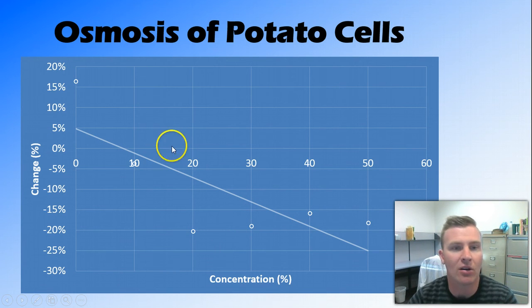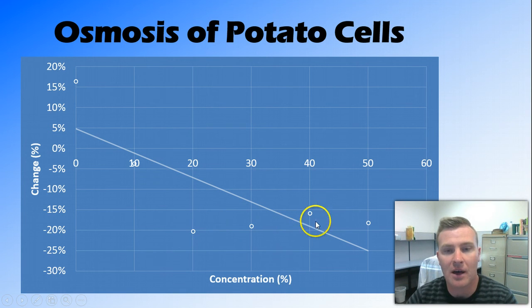So we've seen that osmosis occurs in both directions depending on the concentration of the solution and the concentration inside the cells. Now I talked about the equilibrium point that's been reached here before. When we're talking about solutions, this would be called isotonic, okay, where both solutions are the same concentration. That's pretty much the whole prac, guys.